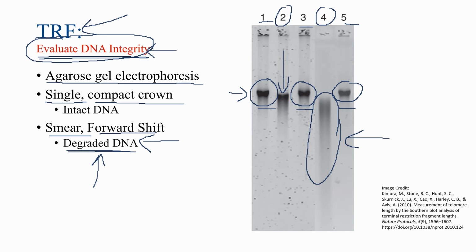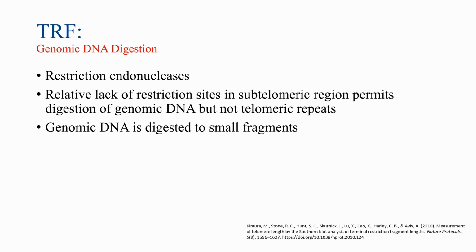Now, after you perform your evaluation of the integrity of your DNA sample, you'll perform genomic DNA digestion. And to do so, you'll utilize restriction endonucleases.